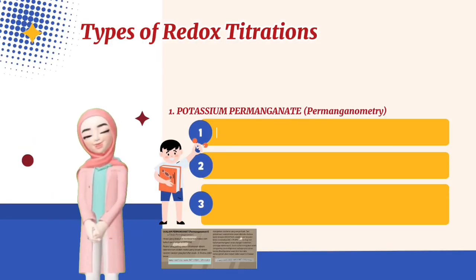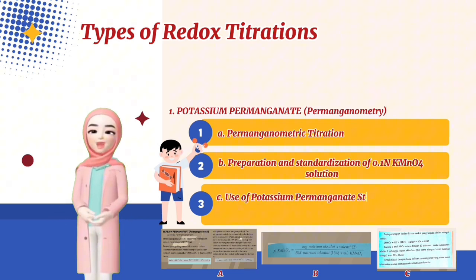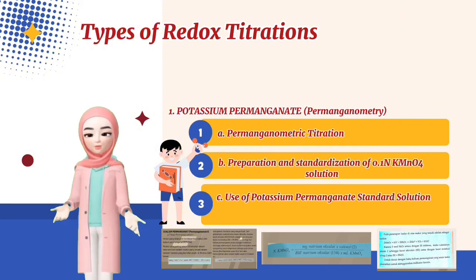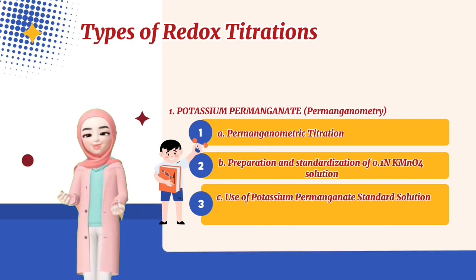Potassium permanganate, permanganometry. A. A permanganometric titration is carried out based on the reaction of potassium permanganate, KMnO4. B. Preparation and standardization of 0.1 N KMnO4. C. Use of potassium permanganate standard solution.